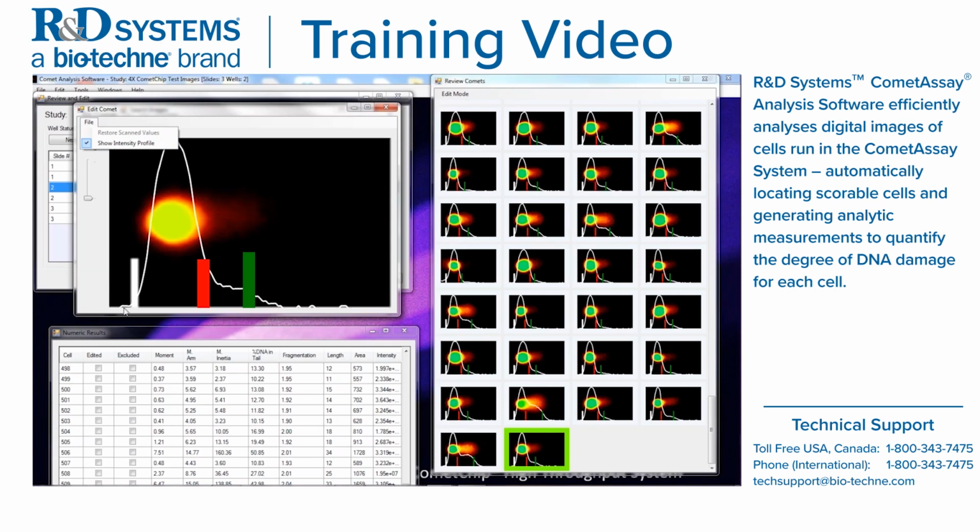So let's left click twice, go under File. I already have the intensity profile showing from the previous image when I selected it. And again, I strongly suggest before you start moving these markers, you really look at where, look at it in high exposure and low. You can, if you want, go ahead and move it, but you'll probably find that it really doesn't affect the overall calculations by much.